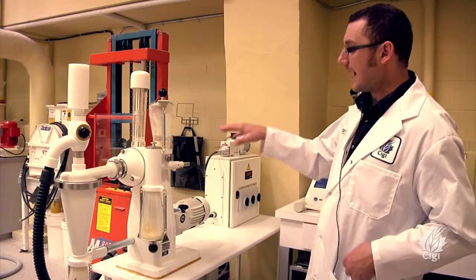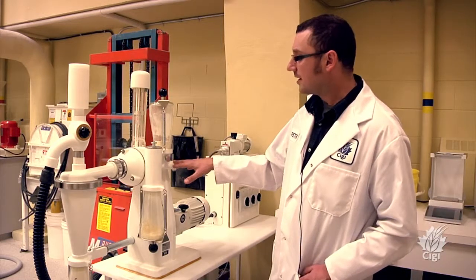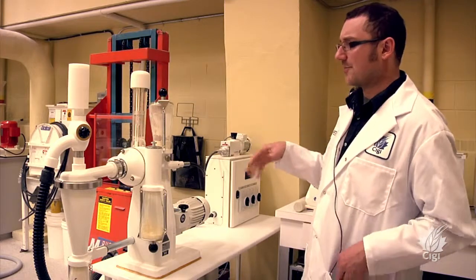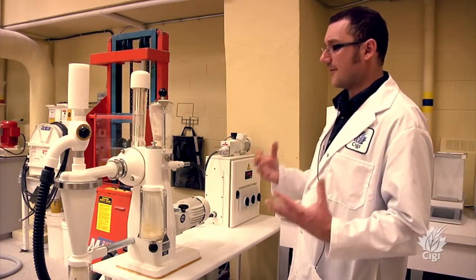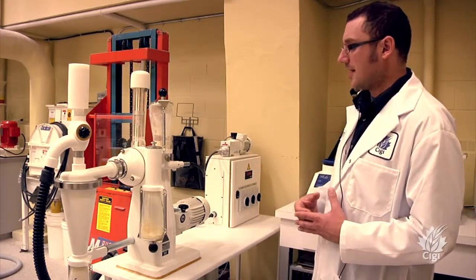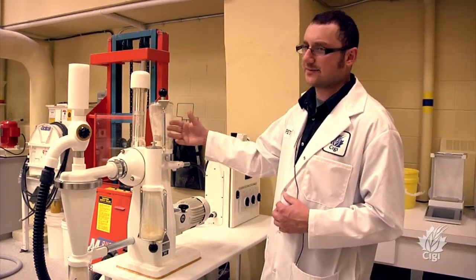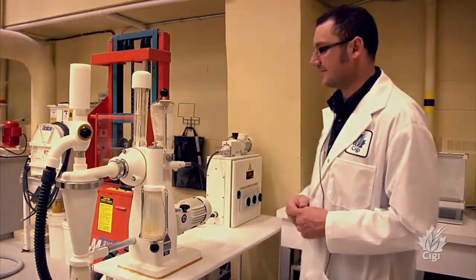This is a lab scale model, and these pieces of equipment on a commercial scale are very large. Before we do any work on a commercial scale, we need to know how these products behave on a small scale.